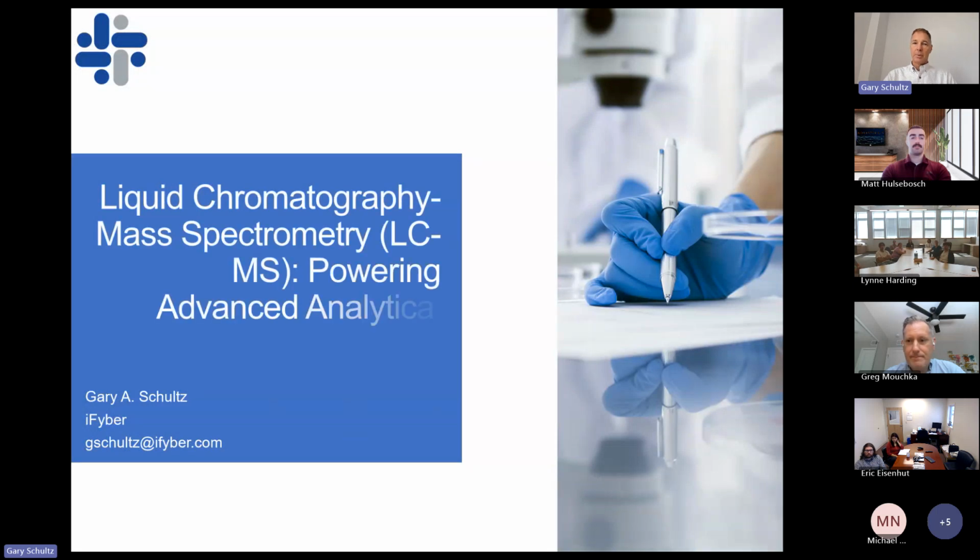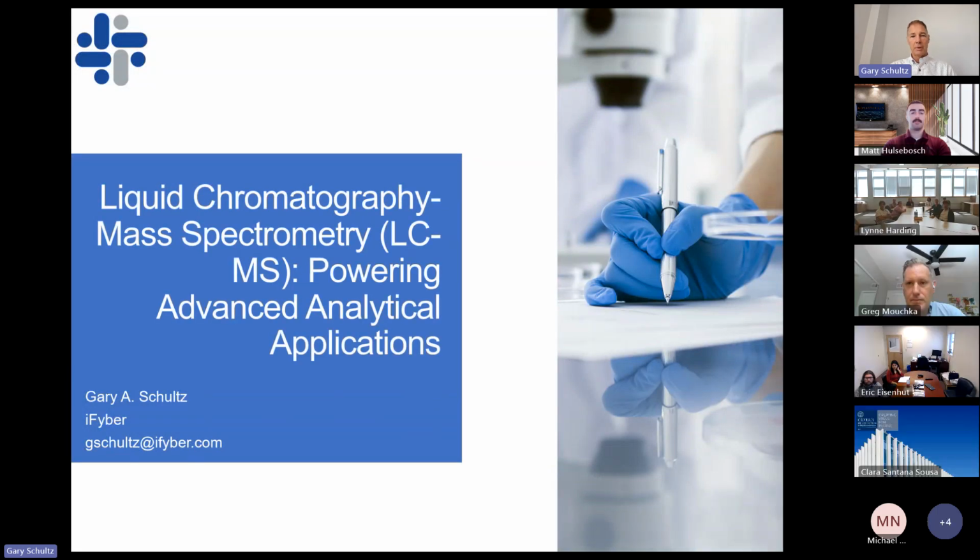So again, I'm just going to be giving a little overview of liquid chromatography-mass spectrometry and how we use this technology to power some of the research that we do here at iFyber.